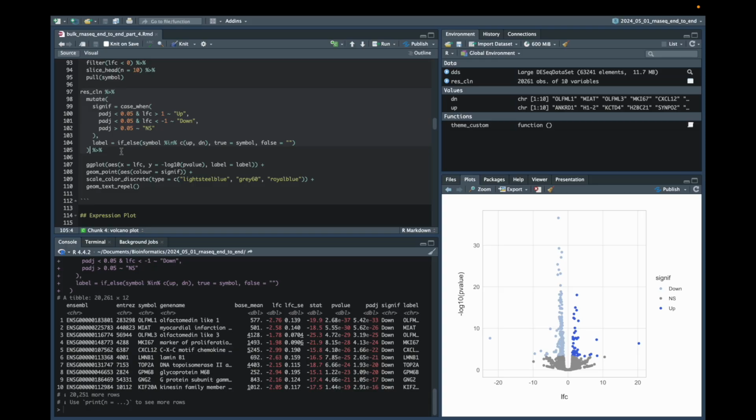So now if we pass that to the ggplot function with the same initial mapping as before, so we've got the log fold change on the x-axis and the inverse log 10 p-value on the y-axis, but now you'll see that we create this global mapping where the label aesthetic is mapped to the label vector that we've created globally, and then we've actually moved the aes call with the color mapping to the signif variable down to just the geom_point layer.